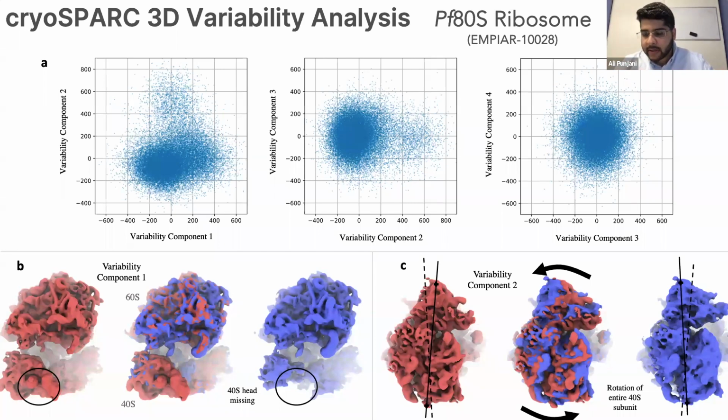If you ask for 3, it'll get the top 3. They may not be in order of variance when they actually come out of the algorithm, but they will be the top 3. And then in the code, we actually measure the variance and sort them by the variance. So that ends up putting them in the right order anyway. So hopefully that answers the question.